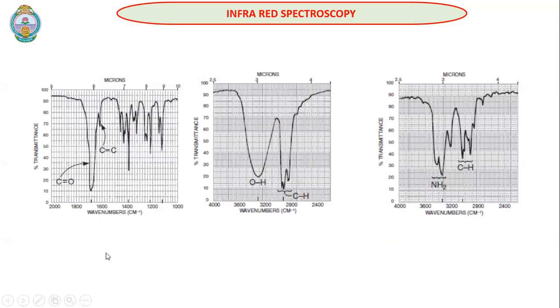Now, we will have a brief look at the intensities of different vibrations. I'll just discuss one or two bands. We have studied the characteristic C=O stretching frequencies and C=C stretching frequencies. C=O stretching frequencies are very, very strong. At the same time, C=C stretching frequencies are very weak or medium. Sometimes it is possible for C=O and C=C to overlap, because of the presence of many C=C, or because the C=O sometimes may not be sharp, and it may be broad. In that case, it may overlap with the C=C, right? To differentiate these two, C=O will give a very strong peak, while C=C will give a weak to medium sized peak.